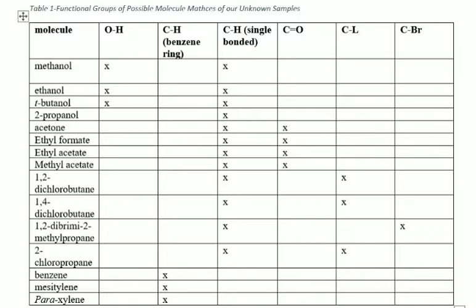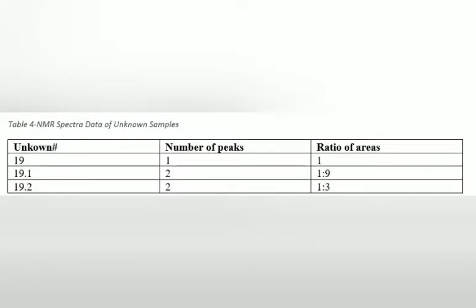Similarly, NMR spectrometers use radio waves to excite hydrogen protons and can determine the peaks and ratios of different hydrogens for the unknown substance. This can be used to tell how many and of what ratio to one another are our hydrogen bonds. Looking at our first IR spectra of our unknown substance 19, we can observe the range of absorbance and where the most noticeable peaks are.